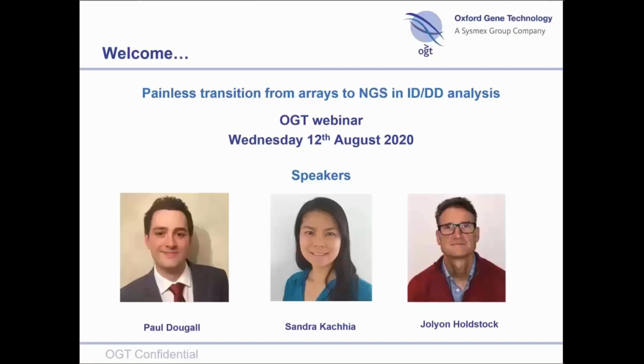The more resource that's available to the software, because it's multi-threaded, the quicker that analysis can run. And from a data storage point of view, we'd say at least 1 terabyte, but you have to bear in mind that the more you use it, the more data you will generate, and the more storage requirements there will be. So I would say as much space as you can find, but start with 1 to 2 terabytes, and then have the ability to expand it later if possible.